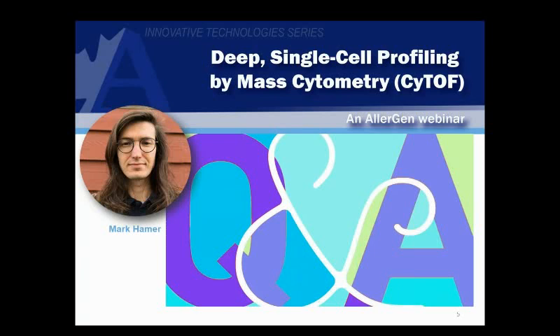And I'll just add to that really quickly, because this is an excellent way to make this point: after doing the analysis and the dimensional reduction, looking at your phenograph plots and stuff like that, you'll see those populations of cells that you expect. They will cluster together and you'll see those consistently from sample to sample. And what you will notice is that if you really do find a unique population, that will separate out and cluster on its own, given that it's a strong enough read, and it really provides some nice visualization of the changes that you see in your system.